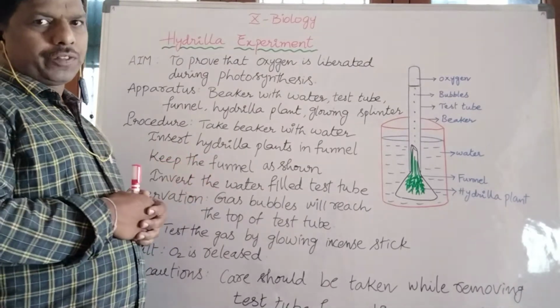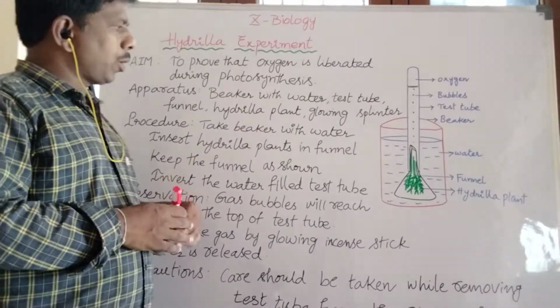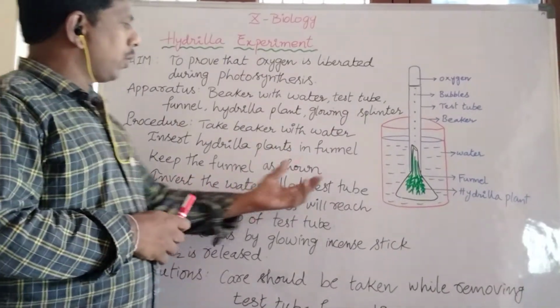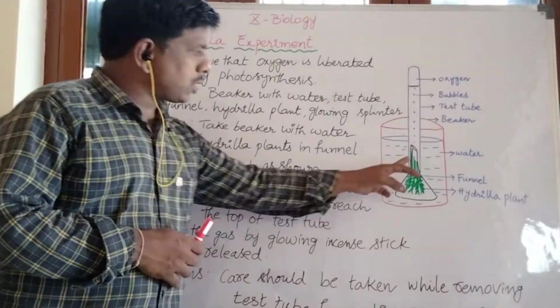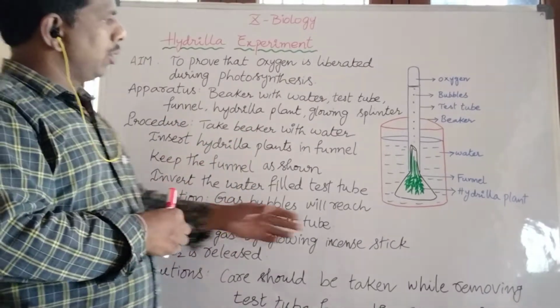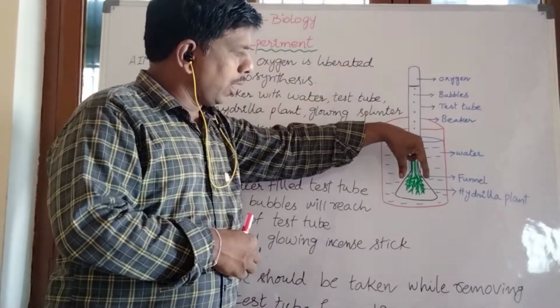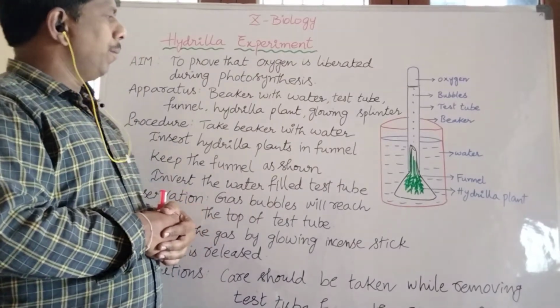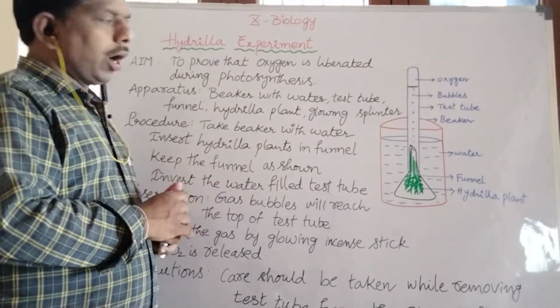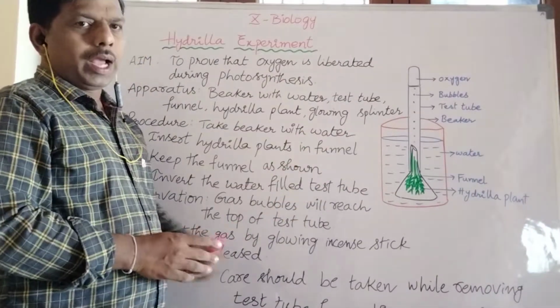And what's the procedure of this experiment? First we have to take one beaker, and in that beaker we have to pour a large quantity of water. Then we have to take one funnel. Through the stem of this funnel, we have to fix some Hydrilla plants, and then this whole funnel along with the Hydrilla plants should be dipped in the water of the beaker. Then we have to take one test tube. That test tube is also completely filled with water, and we have to keep that test tube very carefully on the stem of the funnel like this, as shown in the figure.